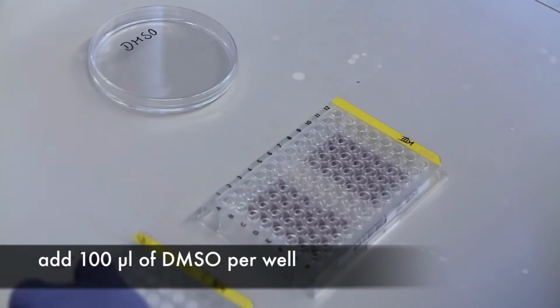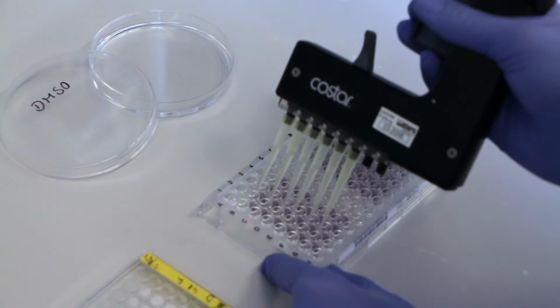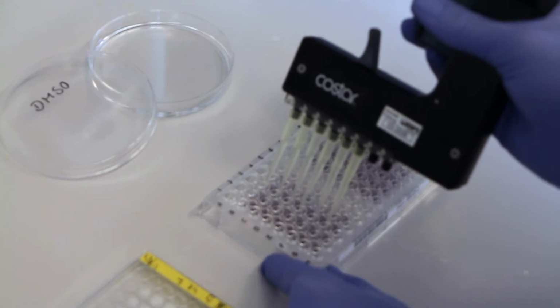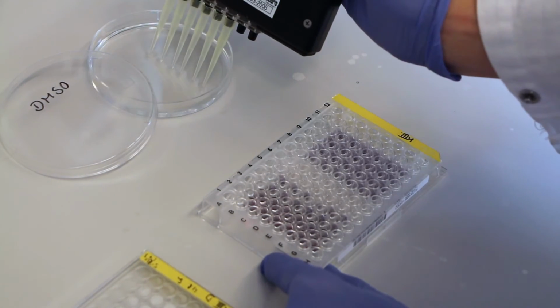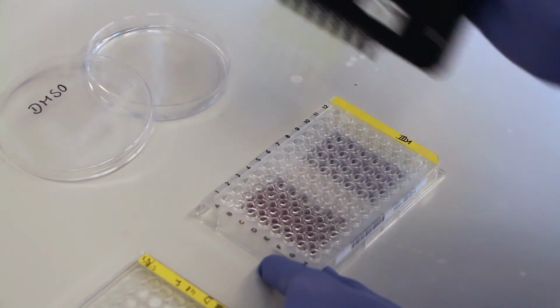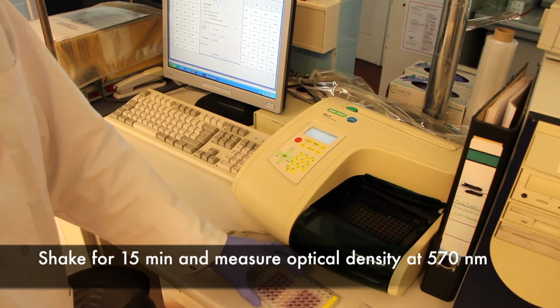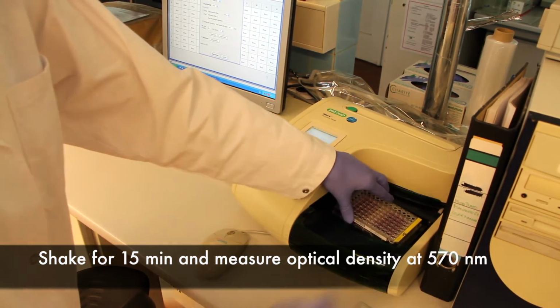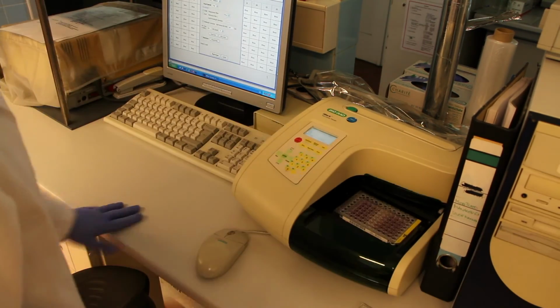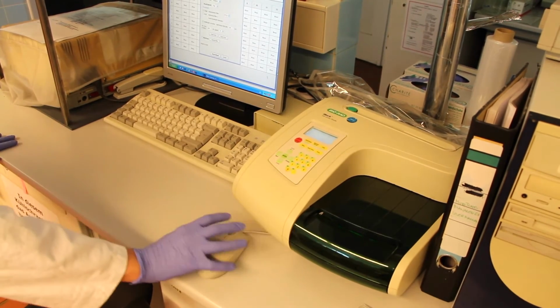In the final step, 100 microliter DMSO per well are added. DMSO dissolves crystals of the formazan dye, which could interfere with the measurement of the optical density. The plates are placed into the photometer and shaken there without light irradiation for 15 minutes. Subsequently, the optical density is measured at 570 nanometers.